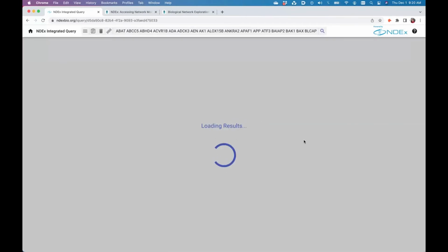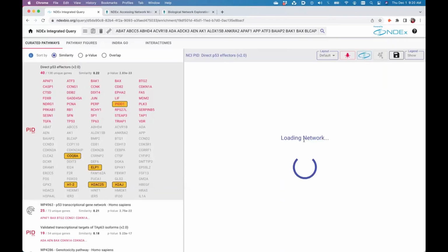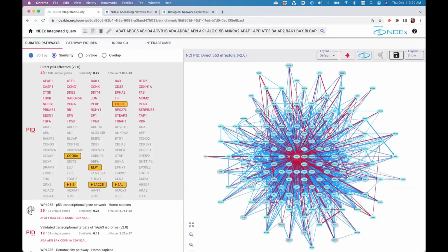And it will take several seconds. By the way, when you have questions, feel free to put them into Q&A or chat in the WebEx, and I will go over them when we are done. So now we are looking at the results.